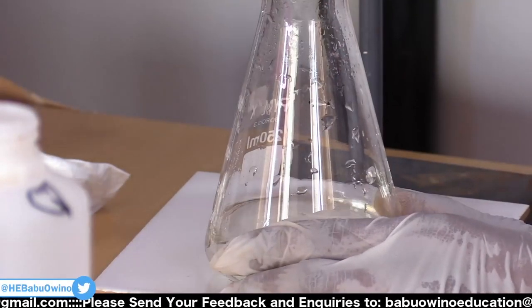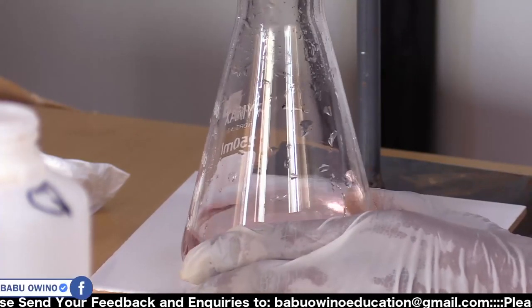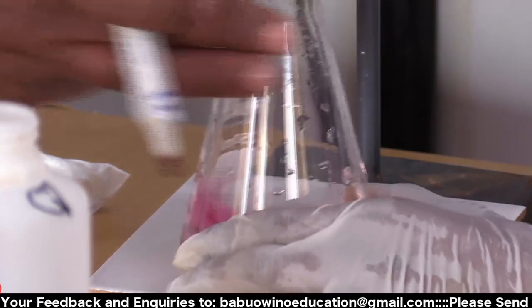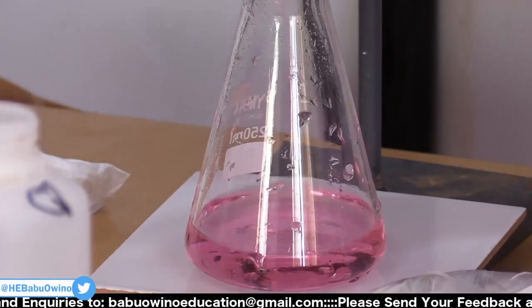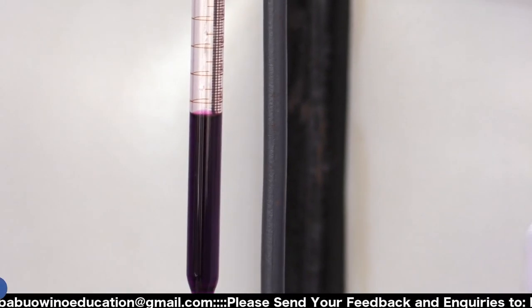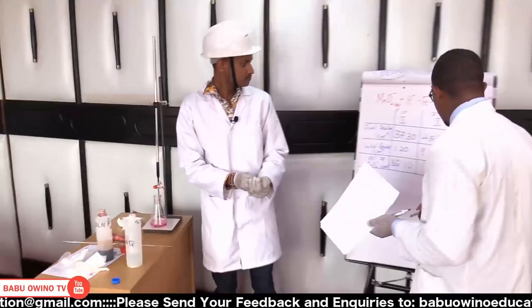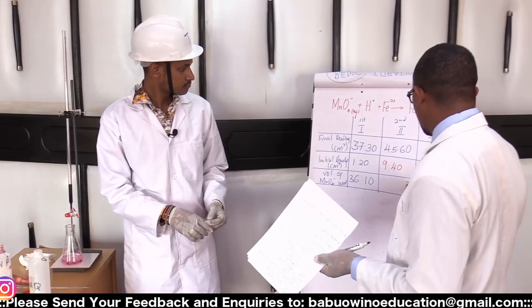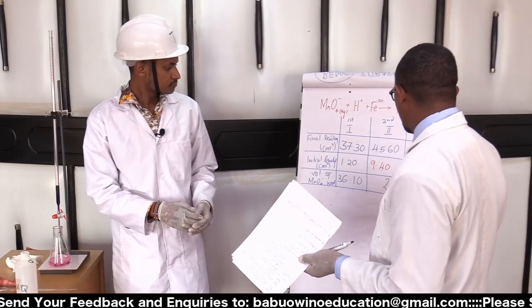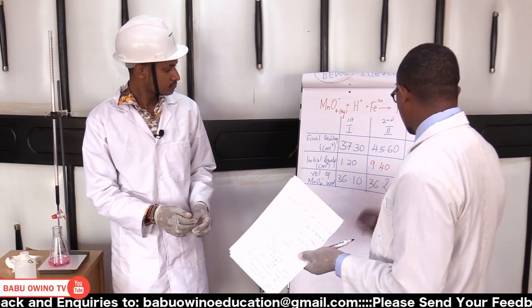Drop by drop now, as you shake. Drop. Good. So that's nice. Read for me. That's 45.6. So 45.60. Consistency in the decimal points. So this gives you 0.2, that gives you 36.